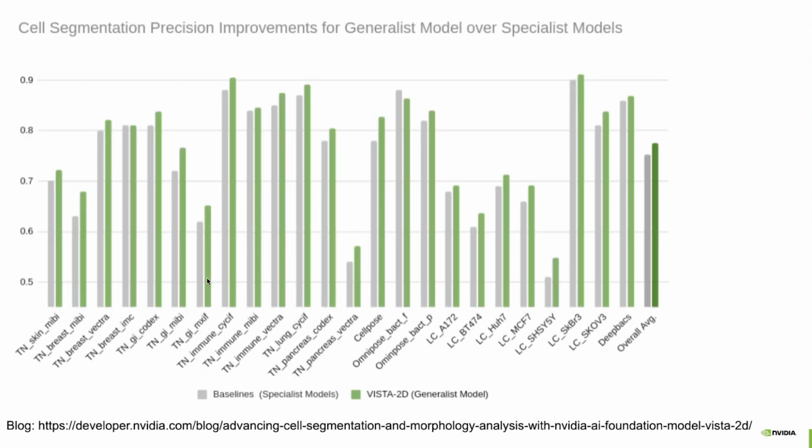Okay, so this is a screenshot from our blog post. By the way, we have a blog about it, or several from the spring. So this is something we wanted to compare. We wanted to see what is the performance of this model, something we call the generalist model, because we combined so many different data sets and they were quite different, with different shapes of cells and organs, and different numbers of channels. So we wanted to see what is the performance of this model in green versus if you train individual specialist models dedicated, for example, to only a single tissue type, let's say breast.